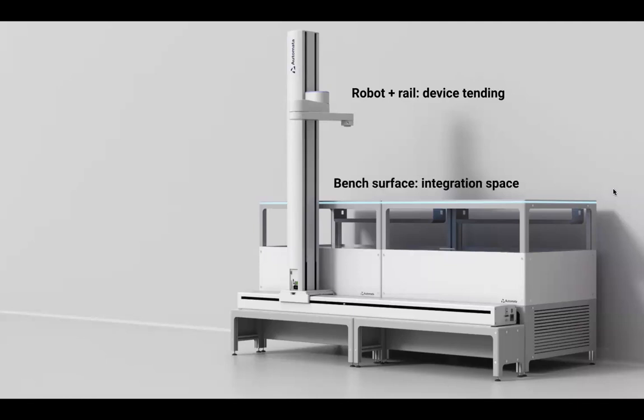And then with that, we have the bench surface, which we're calling the integration space. So it is literally what it says. It's just the bench surface. But this is such an important bit because this is where you will put all of your instrumentation. So all of the things that are actually going to enable the physical parts of your workflow.